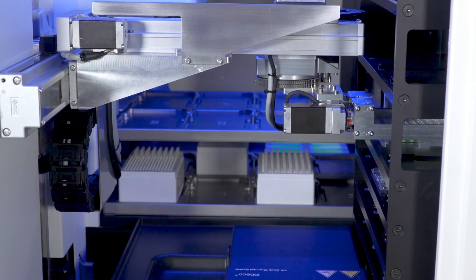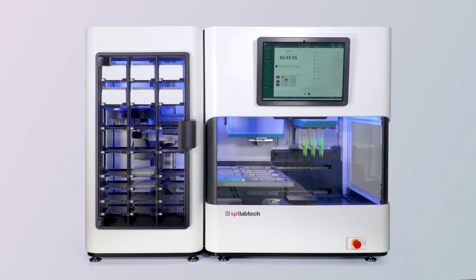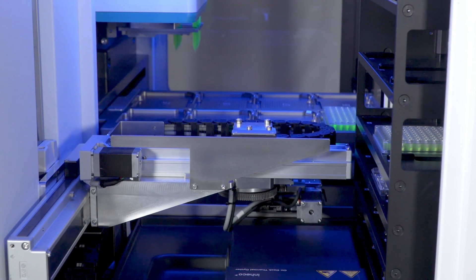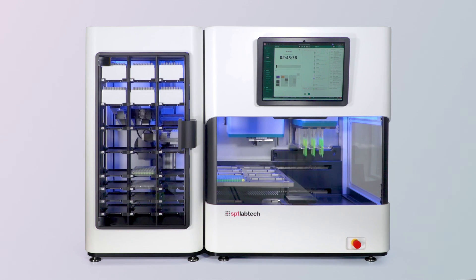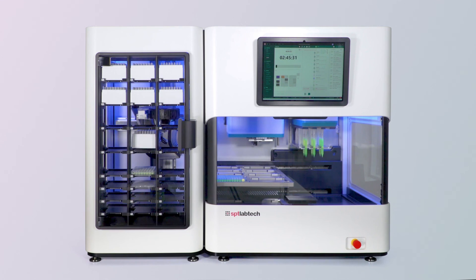It accommodates a variety of labware such as plates, lids, and tip boxes — including the tip box placed into the lower deck earlier. You can see the tips being returned into the Firefly PLUS module. And that completes the protocol.